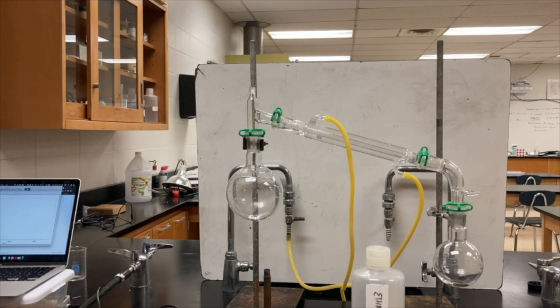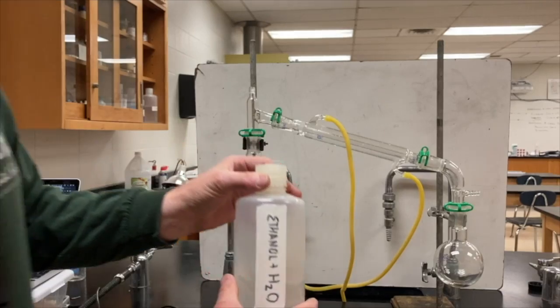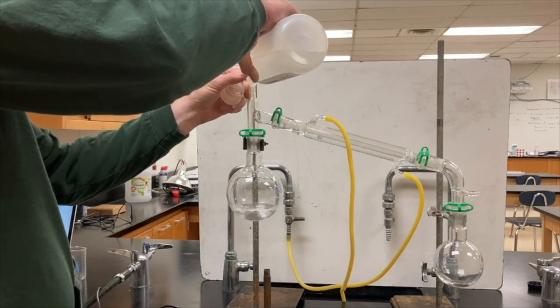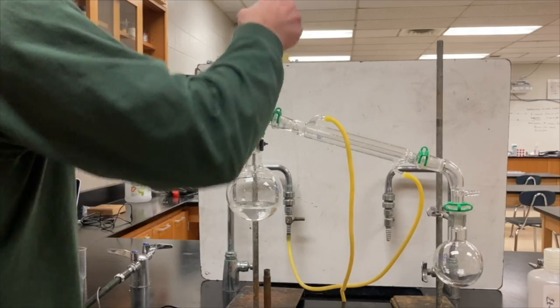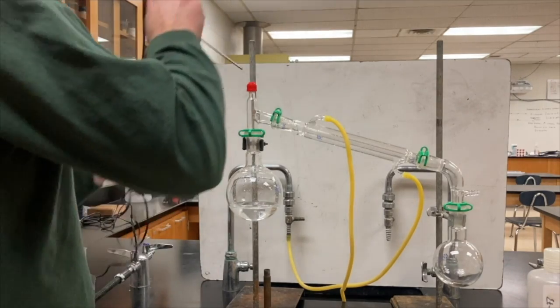In this video, I'm going to take a mixture. It's a homogeneous mixture. It's ethanol and water. Ethanol is a type of alcohol. It mixes thoroughly in water. And I'm going to be using distillation as a way of separating this mixture. So I'm pouring my mixture into the hot end of a distillation apparatus. And I have assembled this whole thing ahead of time according to the instructions in a different video.